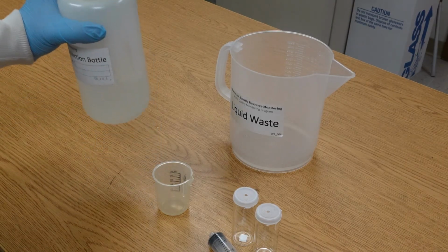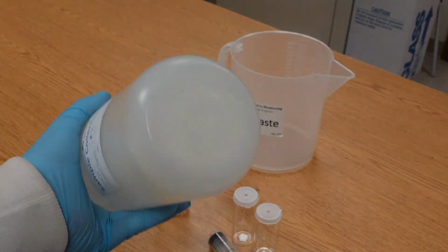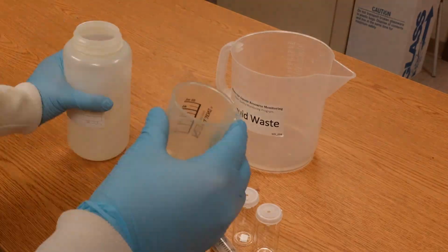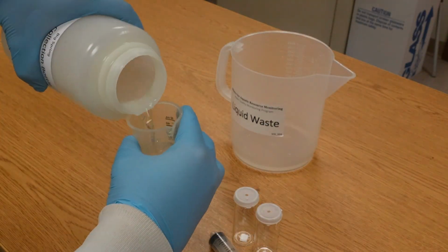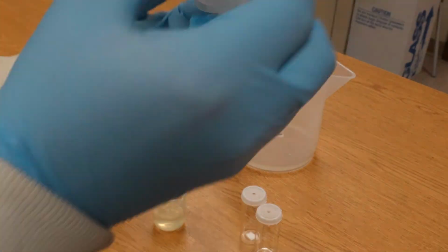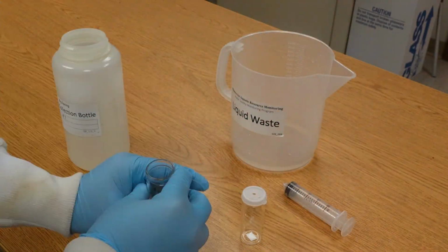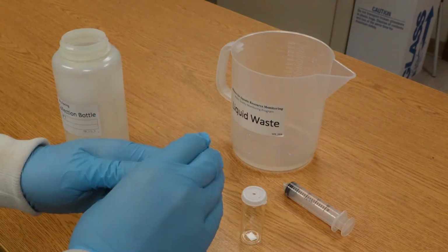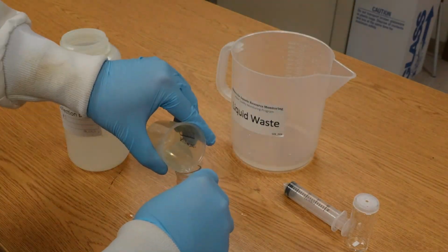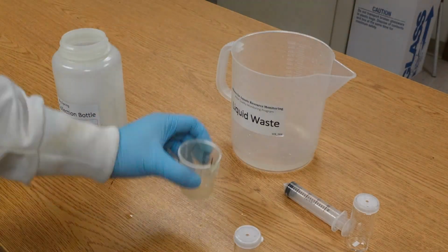Once you have gathered your equipment, invert the sample bottle 3 times and rinse the titration vials, beaker, and sample syringe with sample water 3 times. Please note, we do not wash the titrator syringe. Only use a little bit of sample water, but ensure that the water touches all inner parts of the equipment. After you have rinsed your equipment, you are ready to begin your test.